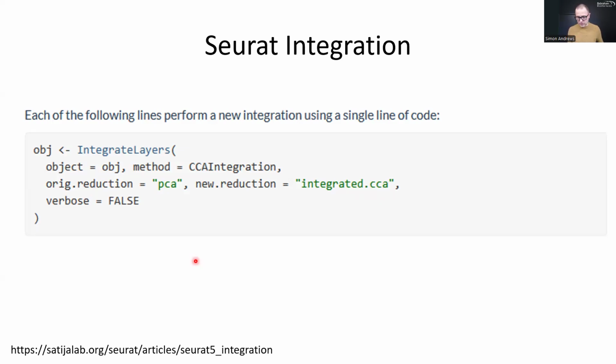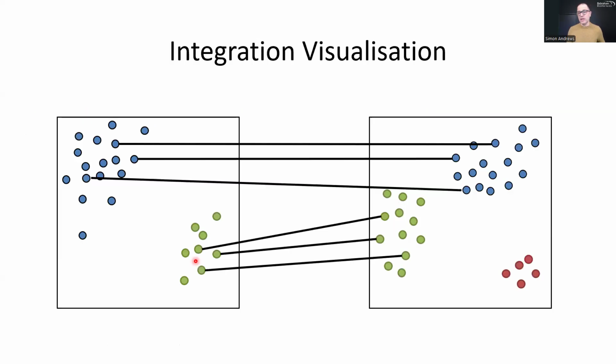So we're going to look at a visualization, and the visualization is going to mimic the slide that I showed you, in that it's going to allow us to see the anchors that were defined when we integrated the data and find a sensible visualization of those. So whether or not we choose to go ahead with the integration, we can at least see how it's going to be structured, and we may be able to use that also just to visualize this on our data without performing integration.